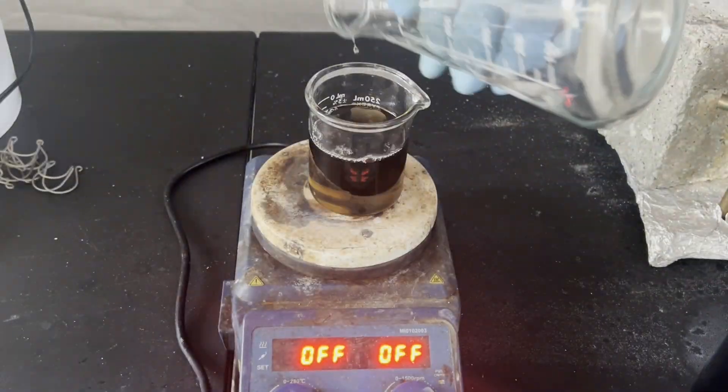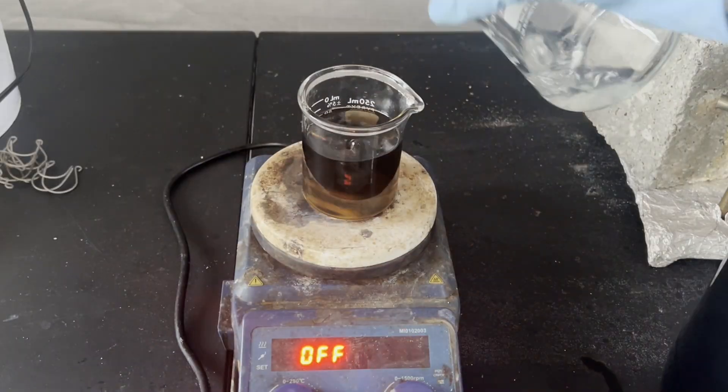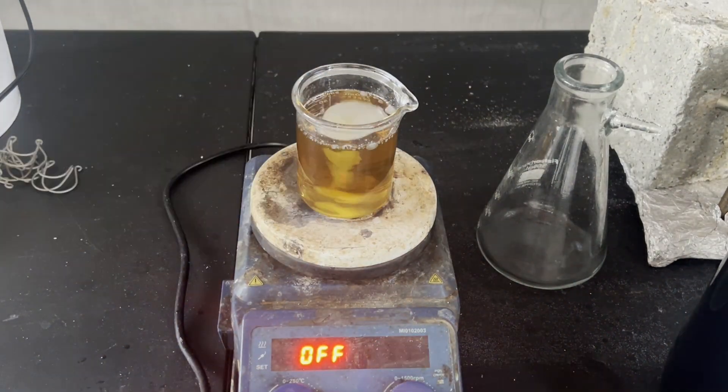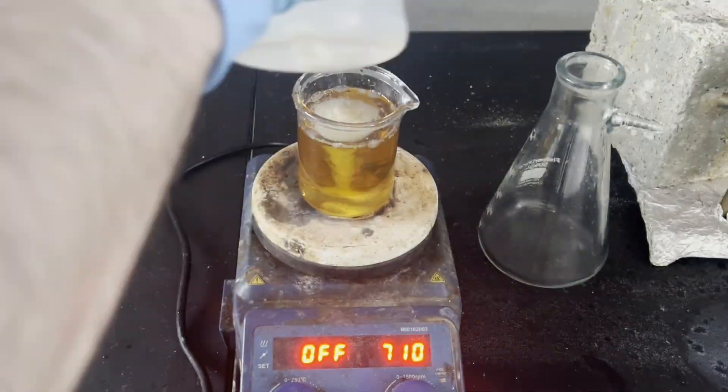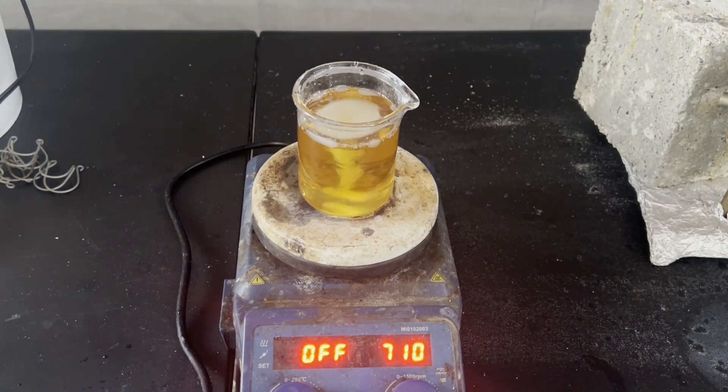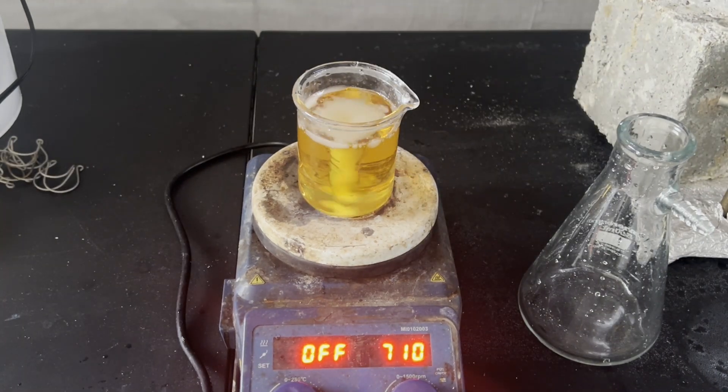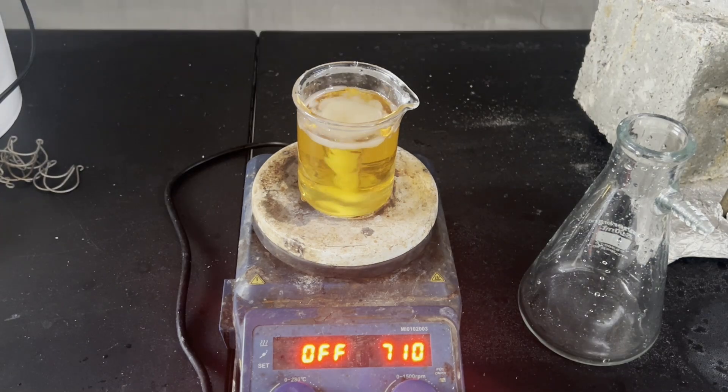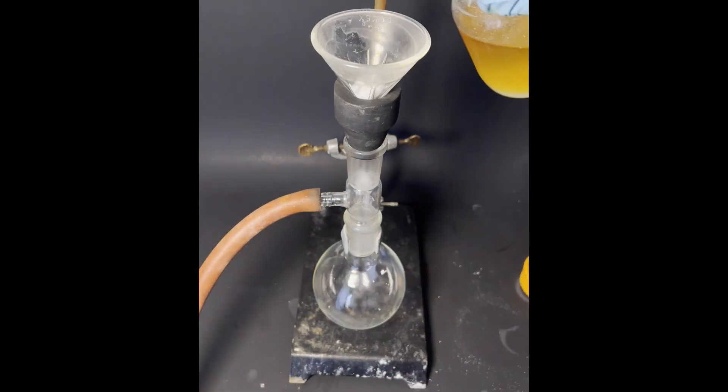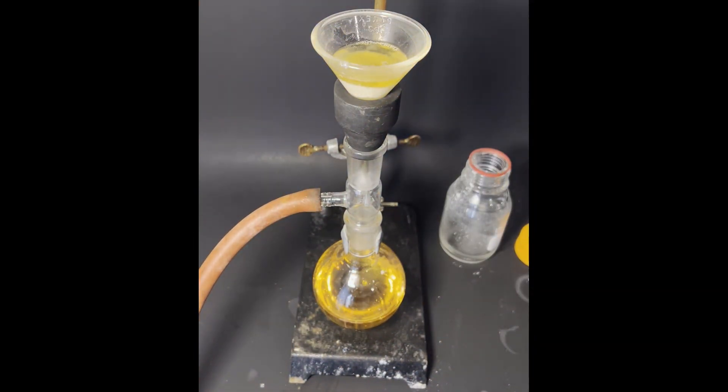I transferred the filtrate to this beaker along with the DCM washings of the reaction vessel and filter flask, and added distilled water to decompose the remaining anhydrous aluminum chloride. Like in the previous video, this caused the organic layer's color to go from dark brown to yellow. I heated the contents of the beaker to evaporate the DCM, adding water as the volume decreased.